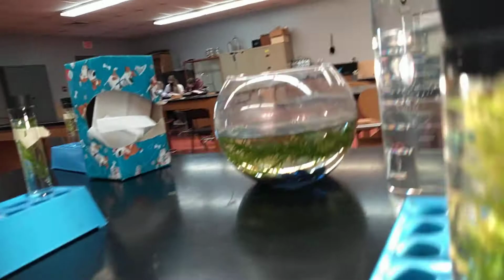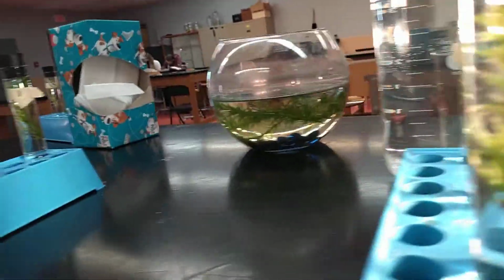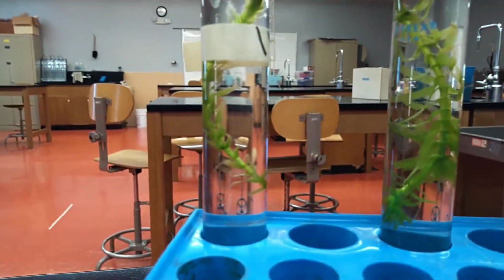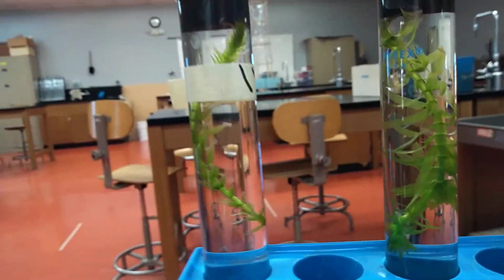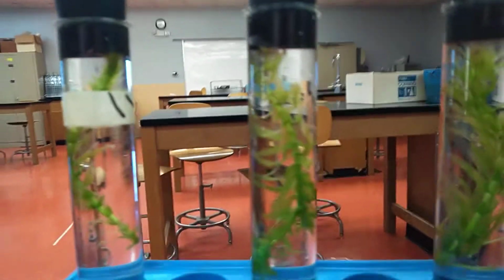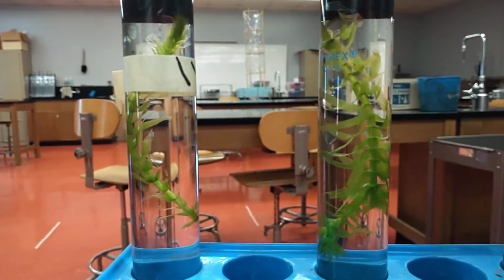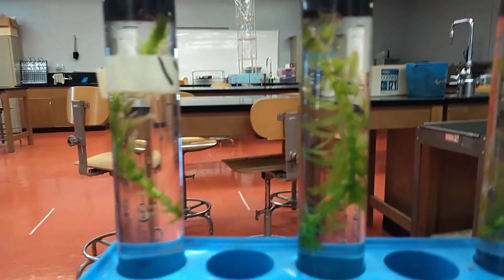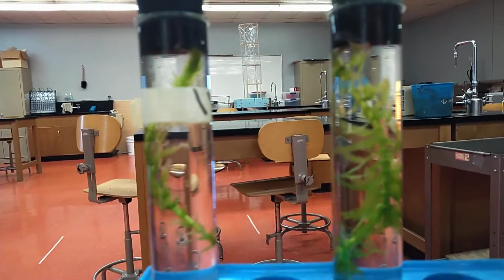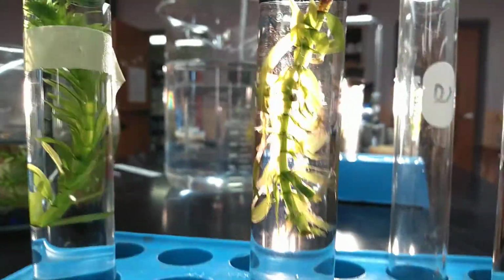But these do have a little more gas produced, they're doing a little more oxygen before they started to go downhill. Looking at these three over here, you're not going to see hardly any gas generated at all. If there is any gas generated at all, it's from cellular respiration, because these plants are still alive. They may not be thriving, but they're still alive. So little gas is produced from cellular respiration, but you can also see a color difference. These are not as green as these are over here.